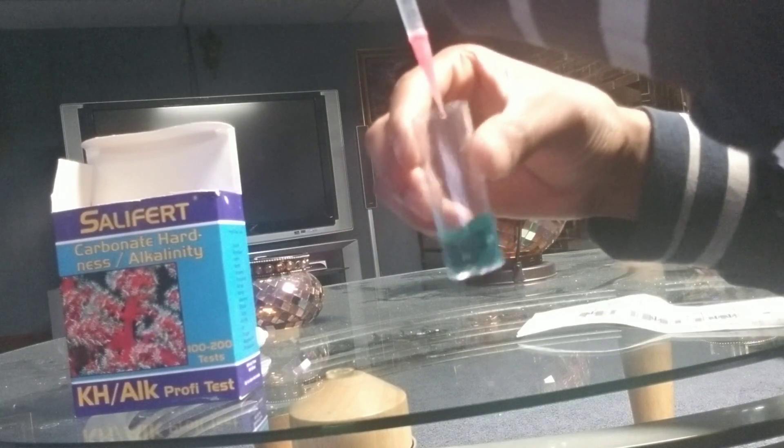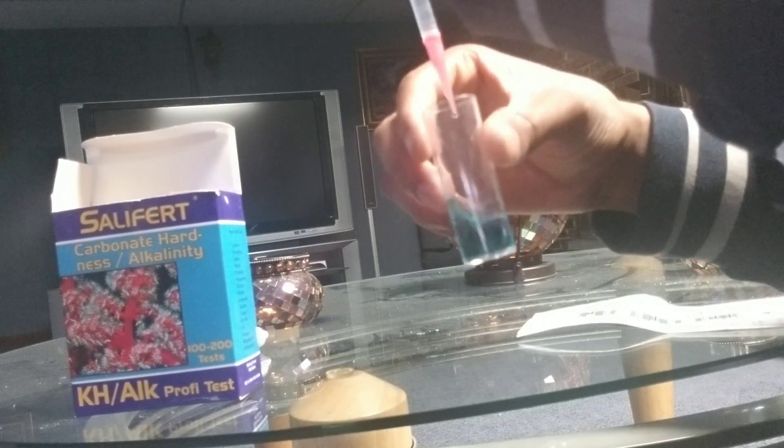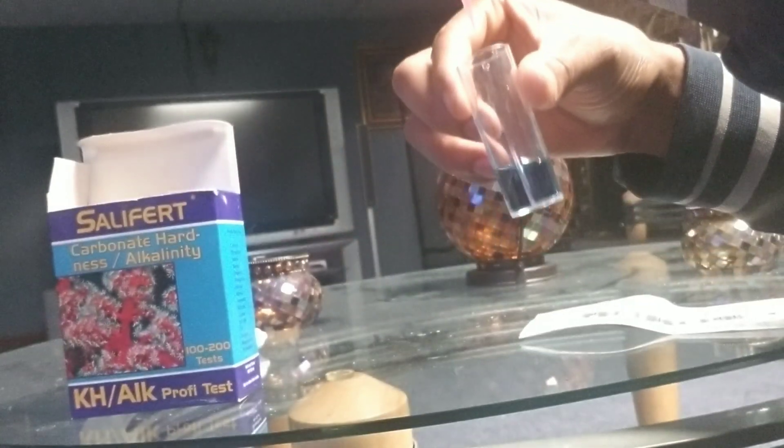Now add drop by drop and swirl. Keep swirling until you see a color change — this will give you the alkalinity of your tank. You want the color to change from blue-green to an orange-red or pink color, whichever color you observe first.